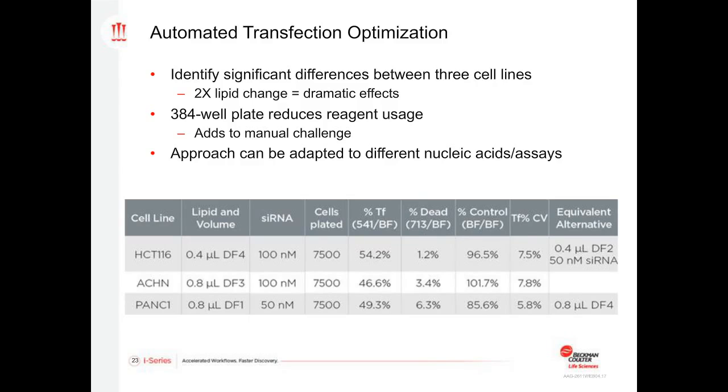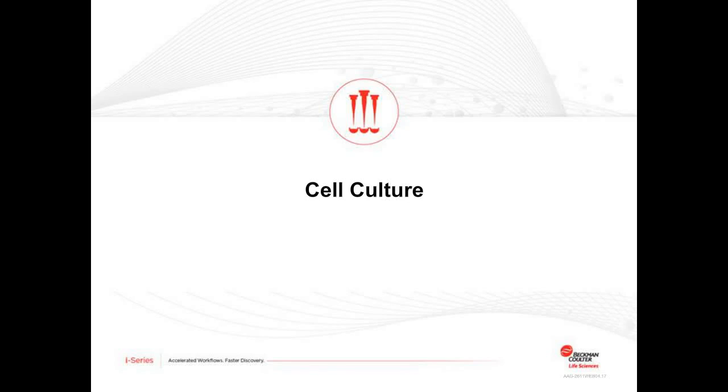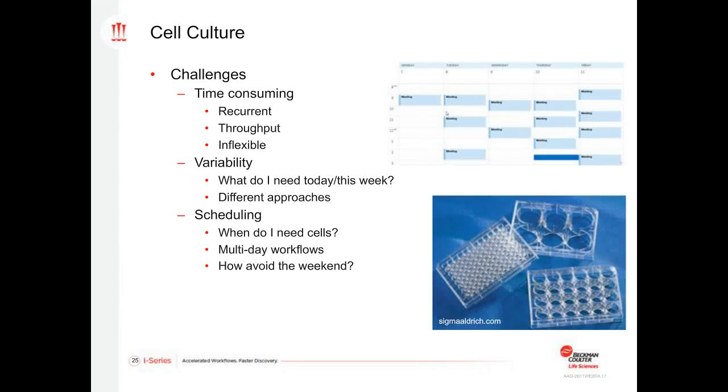So now we'll sort of conclude with basic cell culture approaches. And again, this is something that not necessarily everyone thinks about automating because it's something that was typically done at the bench, but this really is something that can benefit from automation. There's a number of reasons for that because there are a number of challenges associated with cell culture.